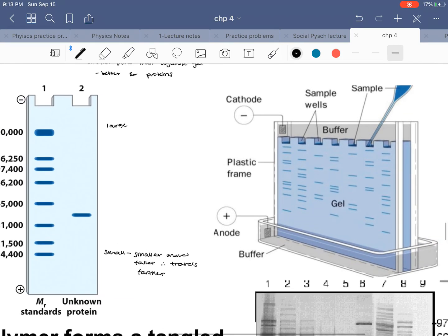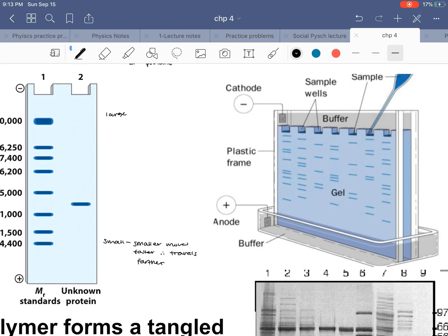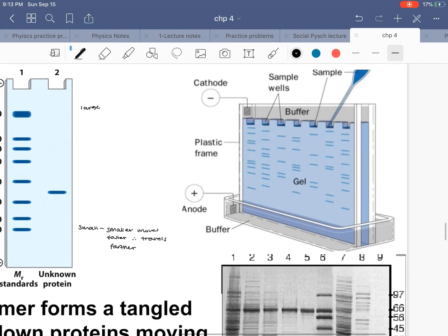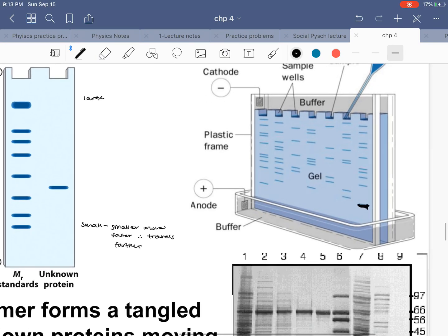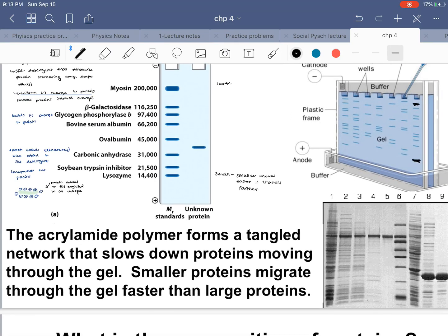So we've got our negatively charged part and our positively charged part. And we know that after we add the buffer and the sample, the faster molecules, or the ones that moved farther, are going to be the smaller ones. And the bigger ones are going to stay over here, because there's more tension as it's moving across the gel, so the small ones are going to migrate a lot faster.